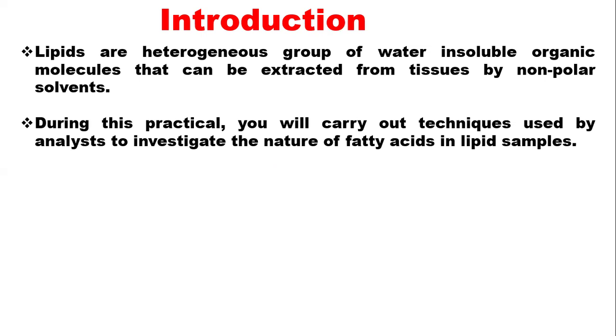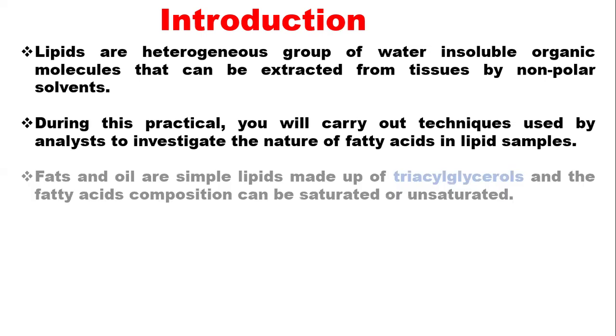Because our practical is on the simple lipids, in today's class we'll be discussing the simple lipids. Fats and oils, which are examples of simple lipids, are made up of triacylglycerols, and the fatty acid composition can be saturated or unsaturated. You remember triacylglycerols have a glycerol backbone with 3 fatty acids attached in an esterification reaction, in ester linkage.